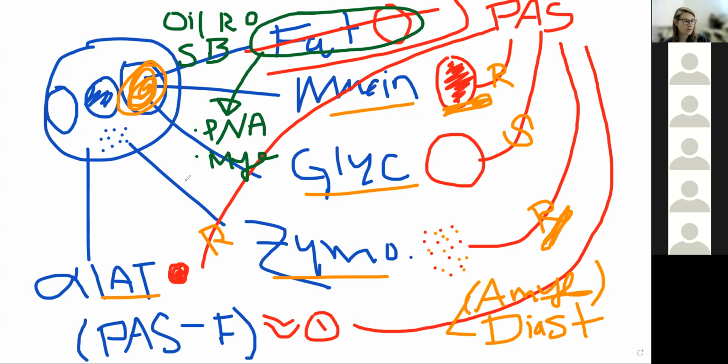Right. We have a couple answers here talking about liver, identifying actual steatosis and size in liver. The other option I'm going to mention is not really used in practice anymore, but it used to be used in parathyroid to identify both intra and extracellular fat. The amount of fat is inversely proportional to the functional activity of the cell. So more fat, less function; less fat, more function. So this was used to identify lesional or hyperplastic parathyroid glands.